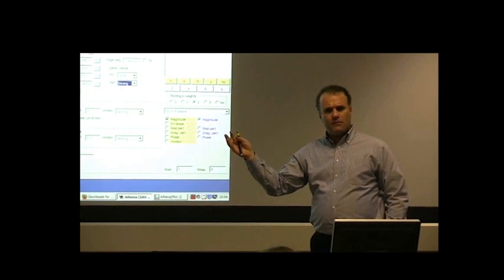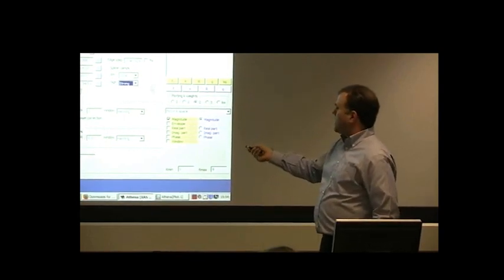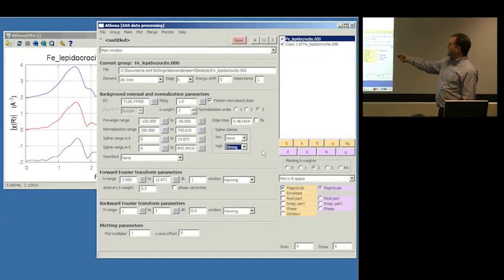So, it turns out you will sometimes find some kind of correlation between Kweight and the high spline clamp. You will find sometimes that if you make Kweight of 3 with a strong spline clamp, you get a really bad result. And sometimes if you make this 3, you have to turn off the high spline clamp.